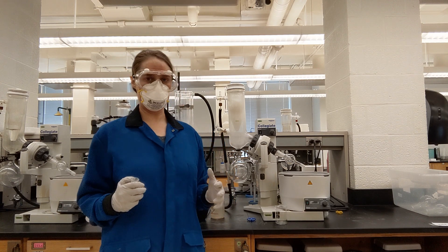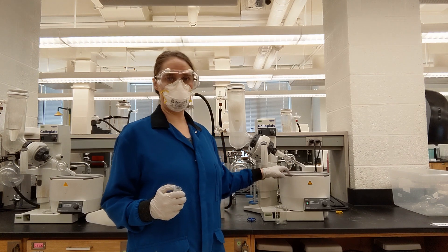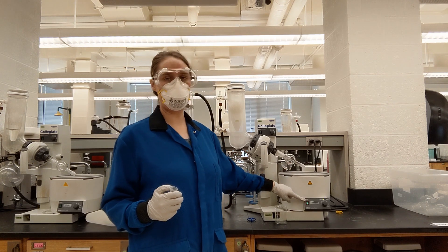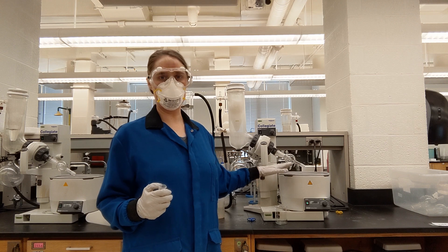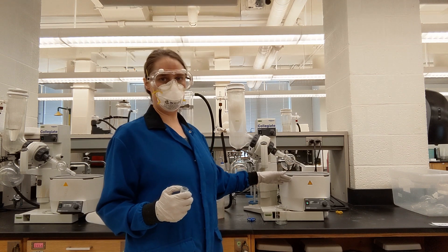In order to get this all turned on, the very first thing you need to do is make sure there's water in the water bath and turn on the heat. This model uses water; other models can use water or oil. This is going to take a few minutes to heat up.